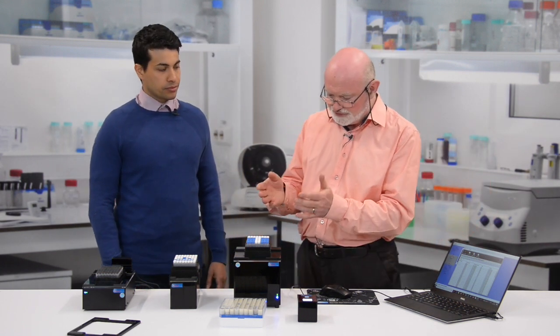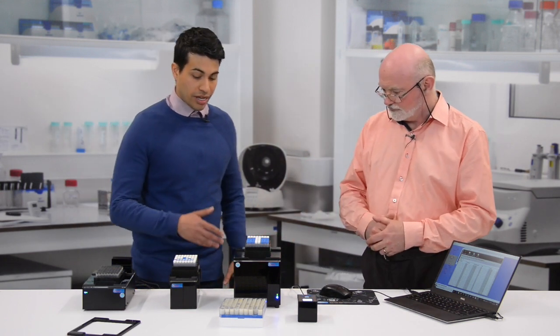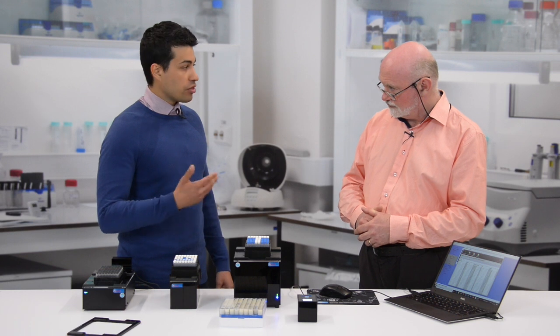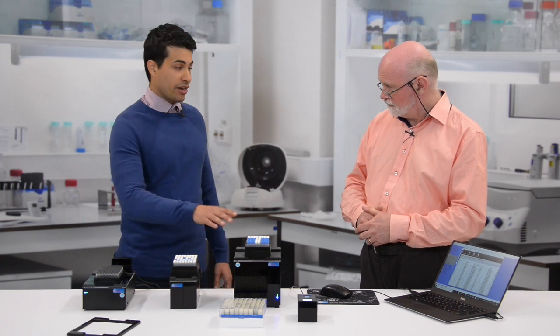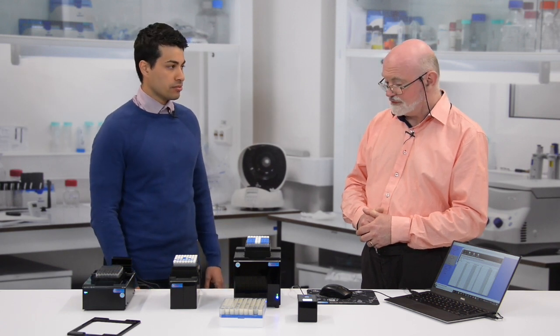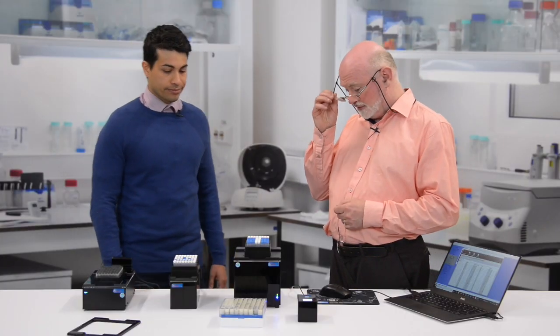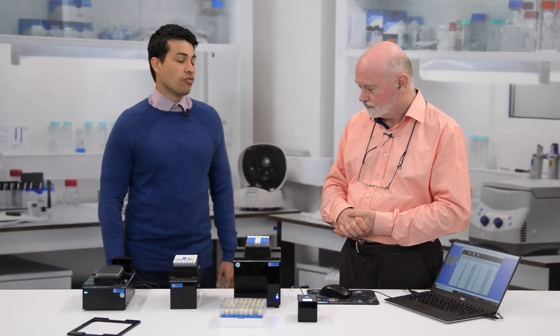What happens if I've just taken one of these racks out of the freezer — how do I stop it from fogging up? Our scanners have two options: a cryoprotection and a non-cryoprotection option. With cryoprotection, you can scan straight from a freezer or from liquid nitrogen and it will cope with those frozen racks. When you place the order, if you let us know you want the cryoprotection option, it will be built and sent out for you. The cryoprotection is available across our full range of scanners.